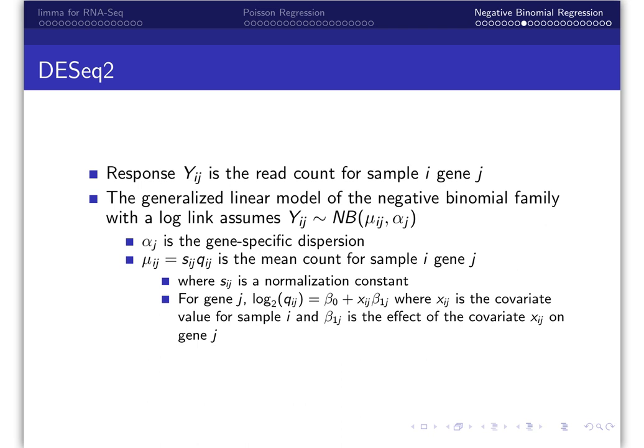The DESeq package was subsequently upgraded to DESeq2, which is also based on the negative binomial distribution and also expects the raw counts of sequencing reads to be provided. Each sample should be an independent sample and not technical replicates. If your experiment includes technical replicates, which is when the same library preparation was distributed over multiple lanes of the sequencer, that is, the sample is divided and hybridized more than once, the resulting reads from technical replicates should be summed, forming one unique sample.